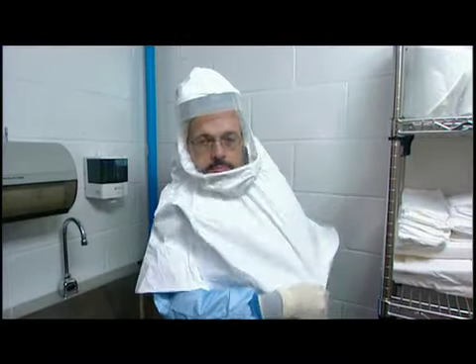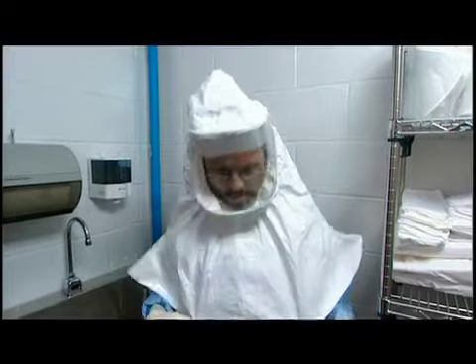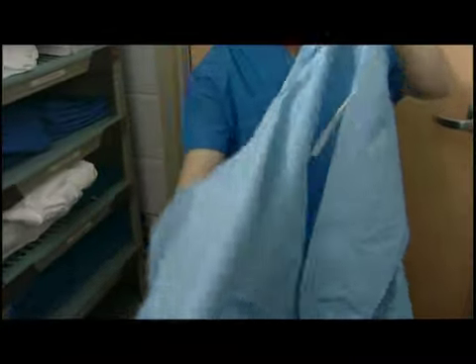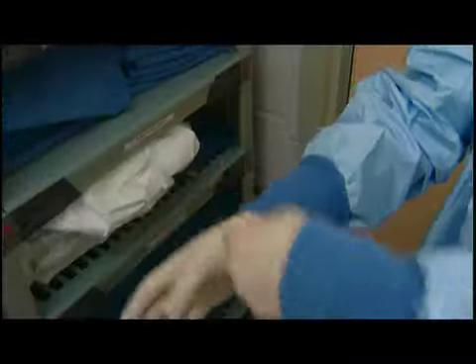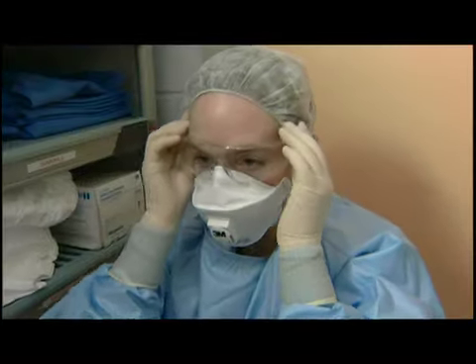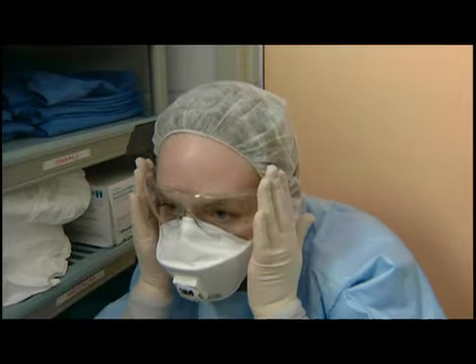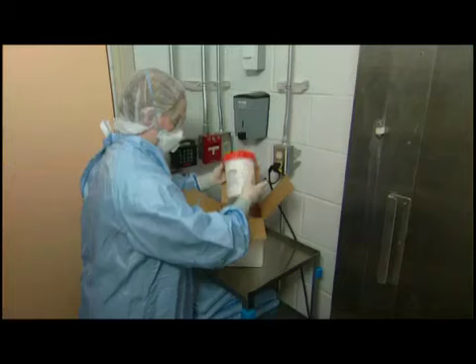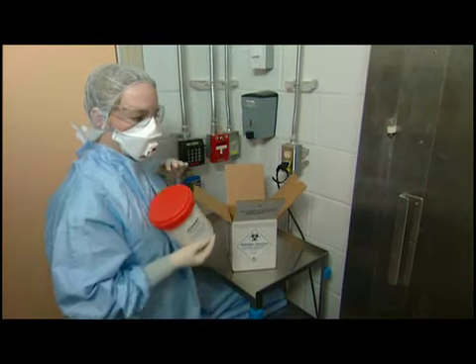A powered air purifying respirator equipped with high-efficiency particulate air, or HEPA, filters should be worn by personnel who cannot wear fitted respirators because of facial hair or other fit limitations. Next, put on your laboratory protective clothing: a solid front gown with tight-fitting wrists and gloves that fit over the wrists. Put on protective glasses and make sure that you have all the material you will need with you before crossing through the shower into the dirty change area.